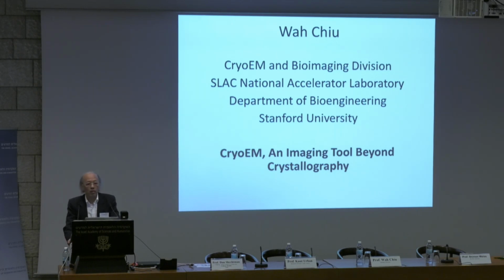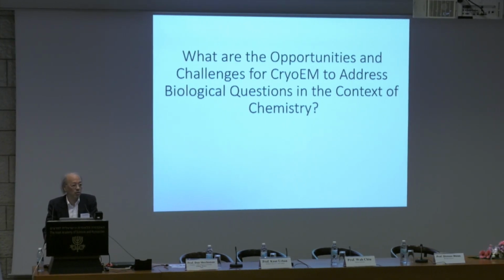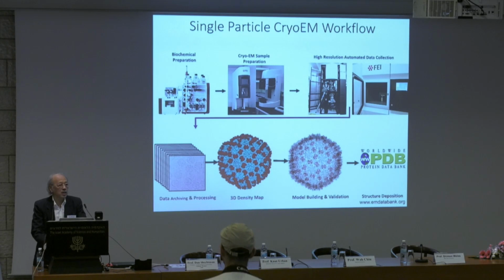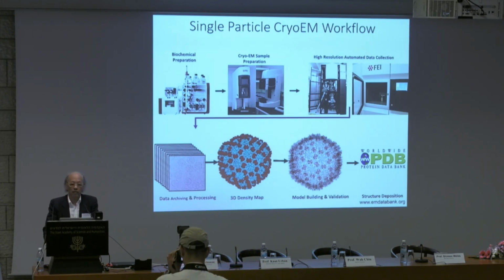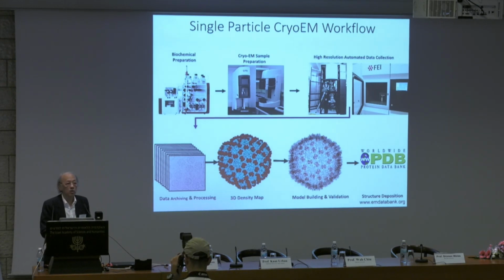And so in the next few minutes, I'd like to share with you the questions. What are the opportunities and challenges for cryo-EM to address the biological question in the context of chemistry? So first of all, what is cryo-electron microscopy? The last speaker laid out very nicely all the development of high-resolution imaging for material science. So what I want to do is to show you this workflow for cryo-electron microscopy for biological specimens.